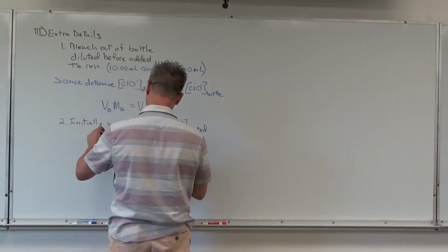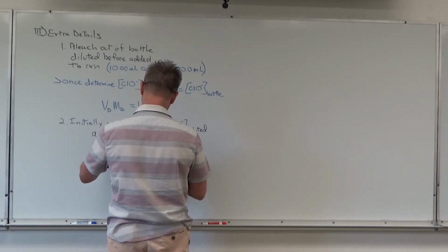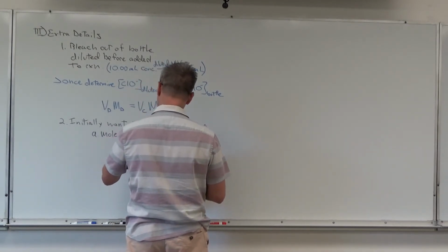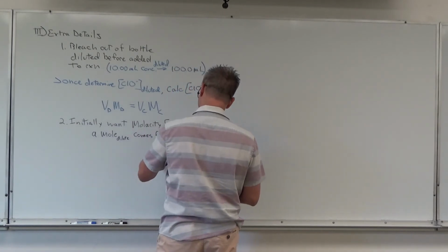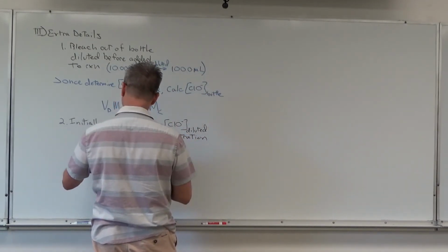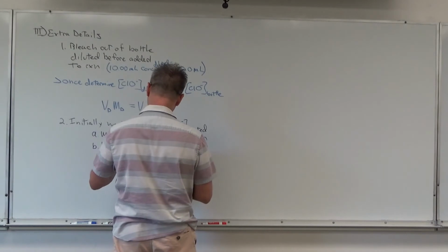I'm really spelling things out here, I hope not too much, but I don't have much left here, so the video's over short. Okay, so moles of diluted, which we need, right? That's our numerator. That comes from the titration. And then liters of solution of our diluted stuff.